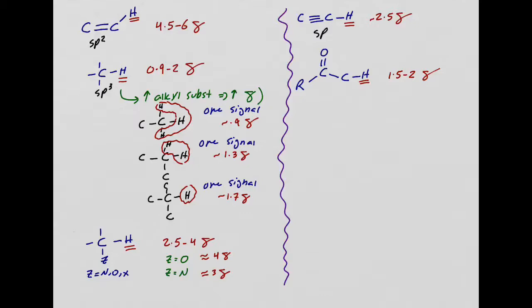This carbon, the carbon bonded to hydrogen, is not directly attached to oxygen, right? Because it's attached to a carbon, then the carbon is attached to an oxygen. So because of that, the ppm is going to be lower, versus here, this carbon is directly attached to an oxygen. Yeah? You guys feel pretty good about this?